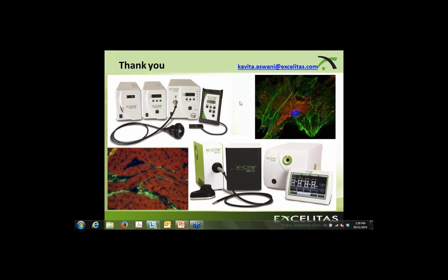And why are LEDs not available in UV and IR range? Again, as I mentioned, those aren't wavelengths that are popular for other industries. Therefore, they haven't been able to migrate over to microscopy, which is a very, very, very small industry in comparison to your lighting industries and areas like that. So it definitely is available, but it would come at a very high price point and a very low lifetime.